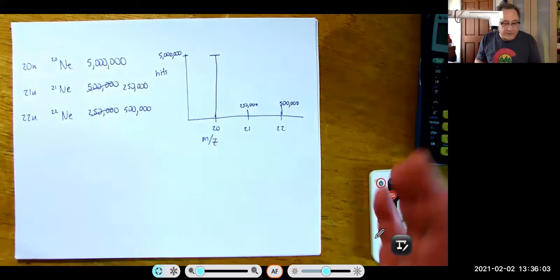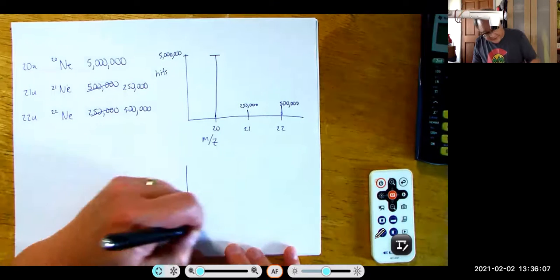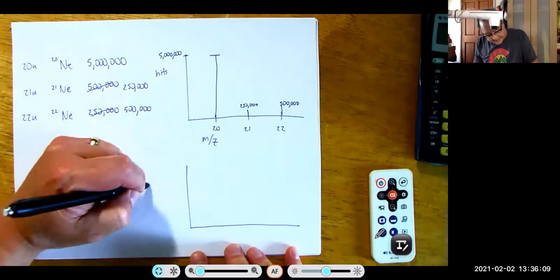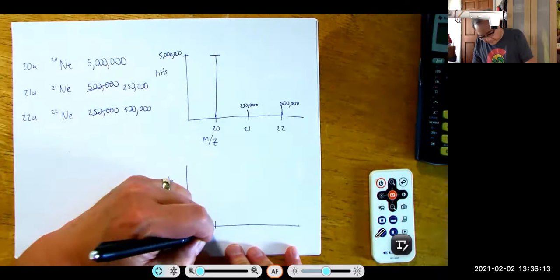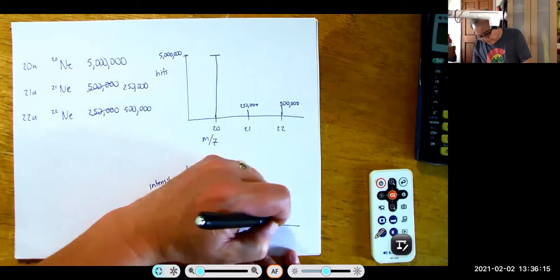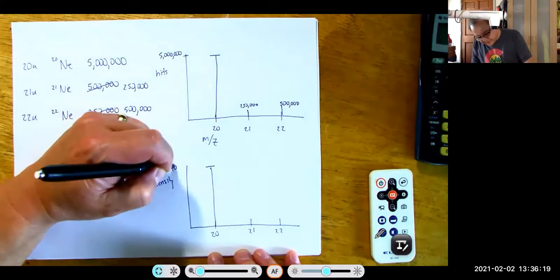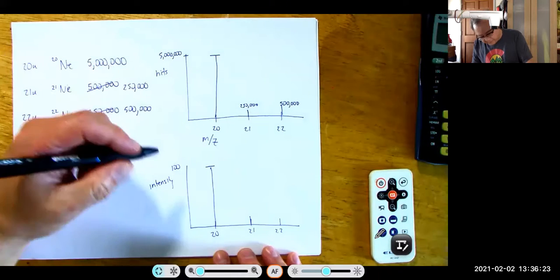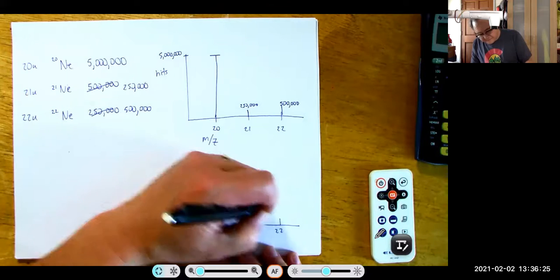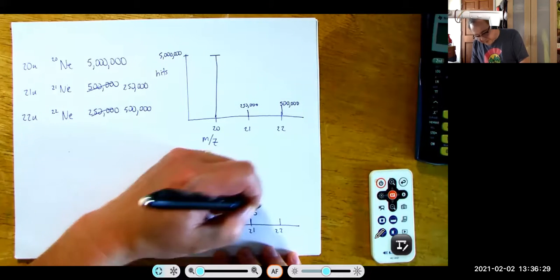But when you look at a mass spectrometer, this is not the data it actually reports. It would report this instead, intensity. This would be given a 100. This would be given a, excuse me, this would be given a 5, and this would be given a 10.